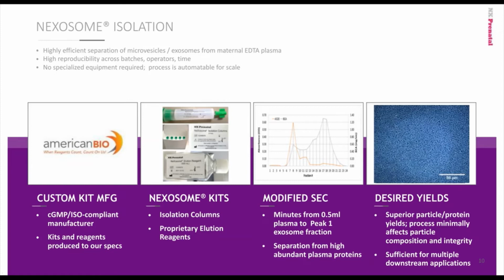There are 24 fractions collected. Now that's more than we usually collect for a clinical assay, but we do this for QA. The 2 peaks indicate where the nano microparticles are and where the plasma proteins are. And that is the second peak to the right. That indicates the plasma proteins. The shoulder next to that second peak represents the particle protein, which of course overlaps the particle fractions indicated by the red peak.